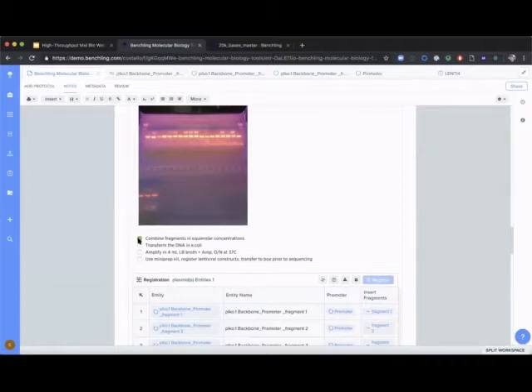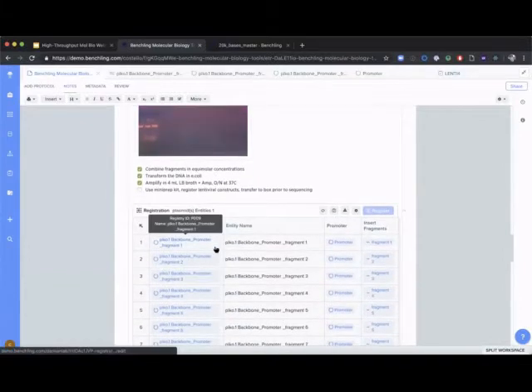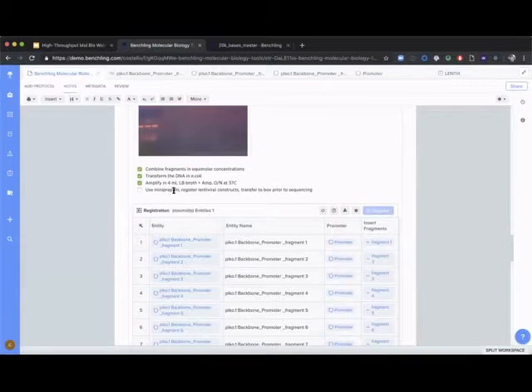Take the next steps to do a classic transformation of my plasmid DNA in E. coli, such as DH5 alpha. I can plate that on an agar plate, pick my colonies, amplify them in something like LB broth, and then ultimately use some sort of kit, for example, to obtain the plasmid DNA associated with the lentiviral construct that I designed.